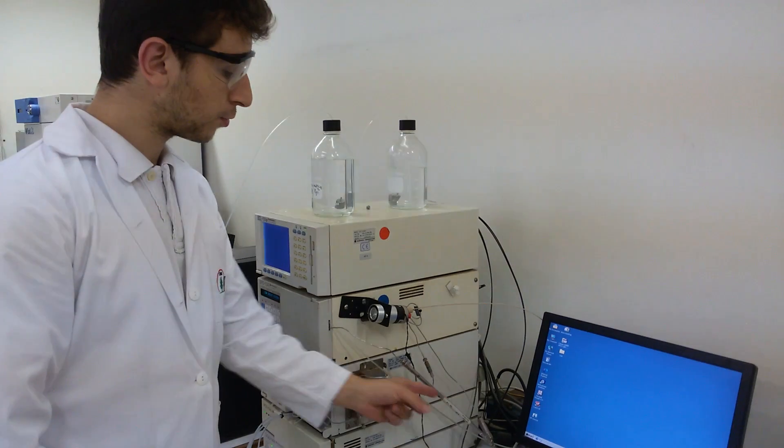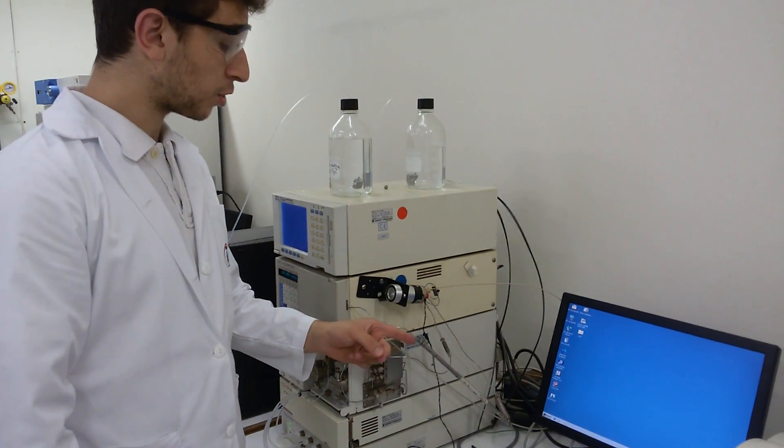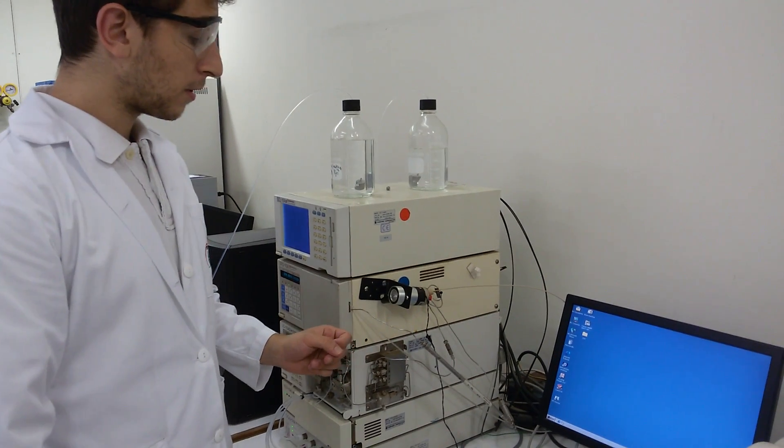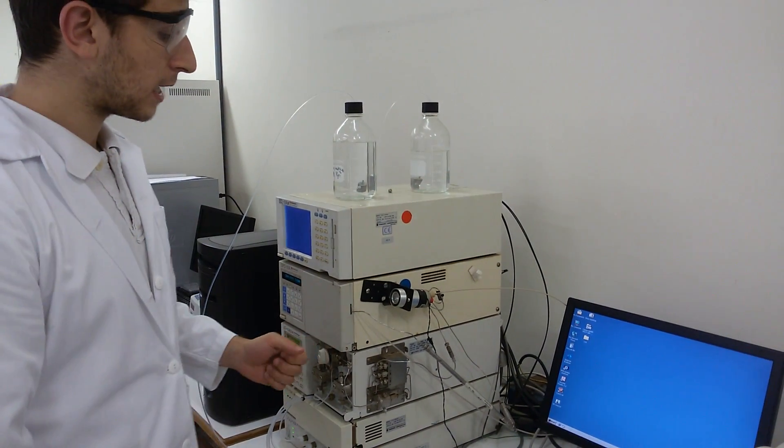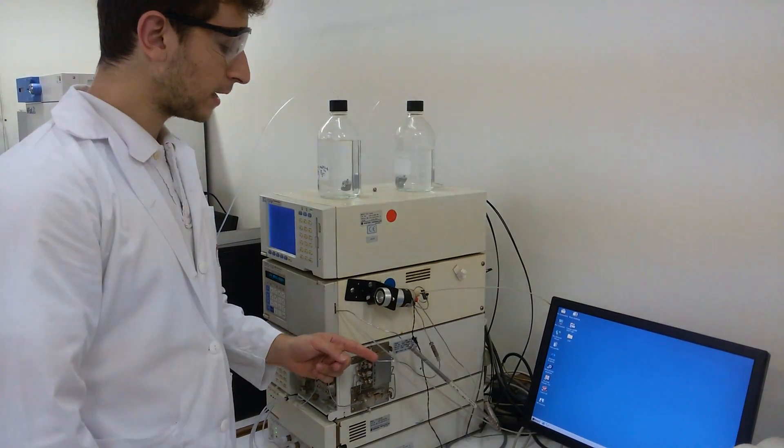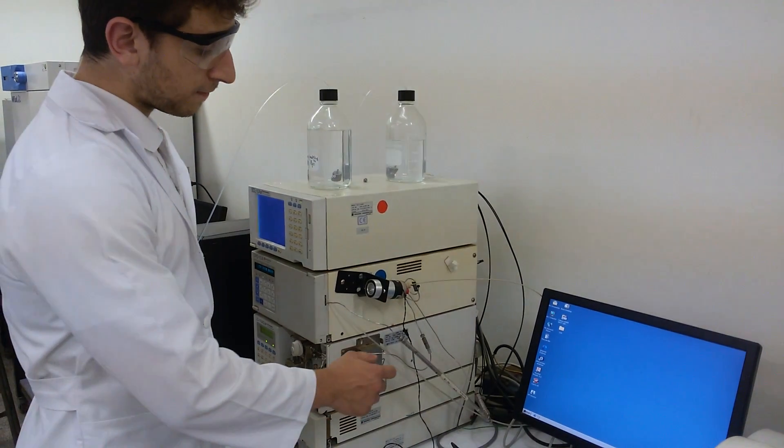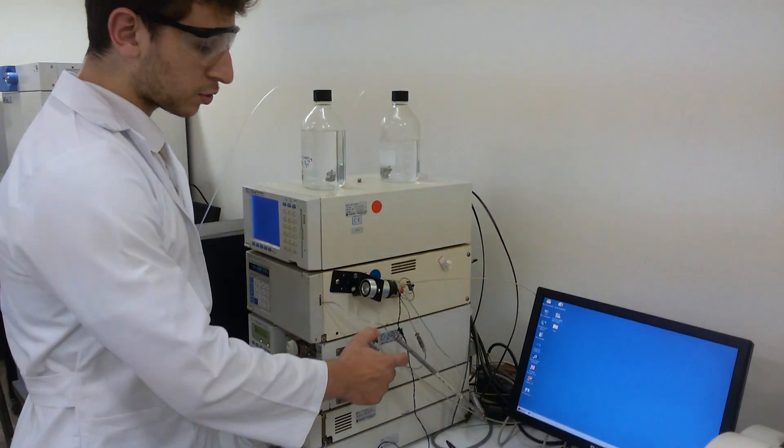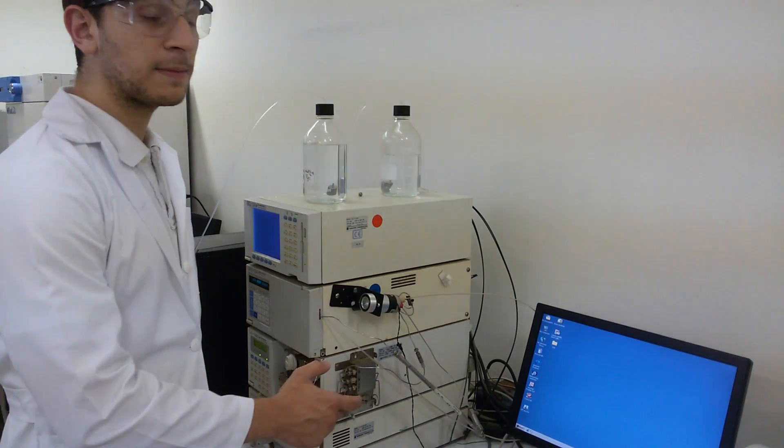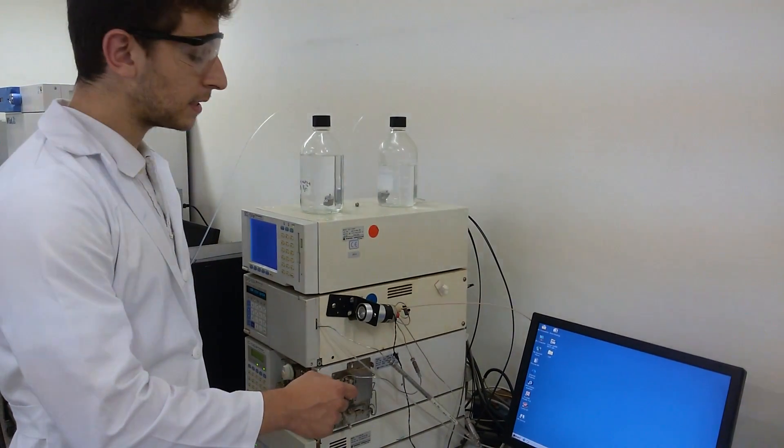Then, our sample will move through the column. The separation, all of the separation occurs inside. The components of our sample, which are aspirin, acetaminophen, and caffeine, will be separated inside. Because our stationary phase contains silica, which is extremely polar, and embedded with carbon, which is extremely unpolar.